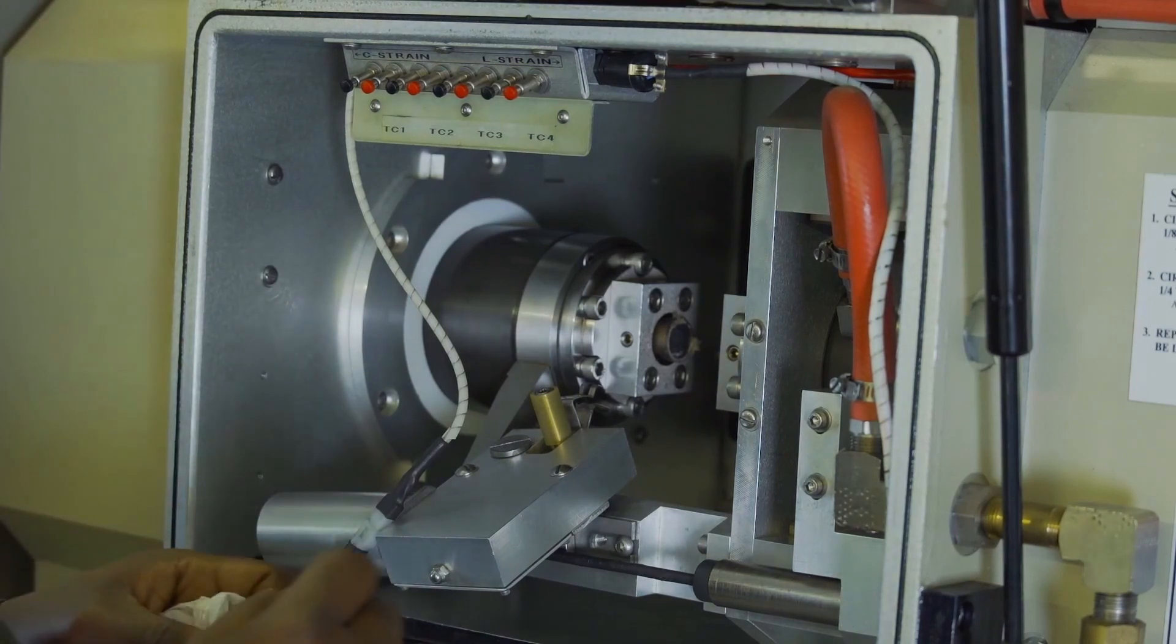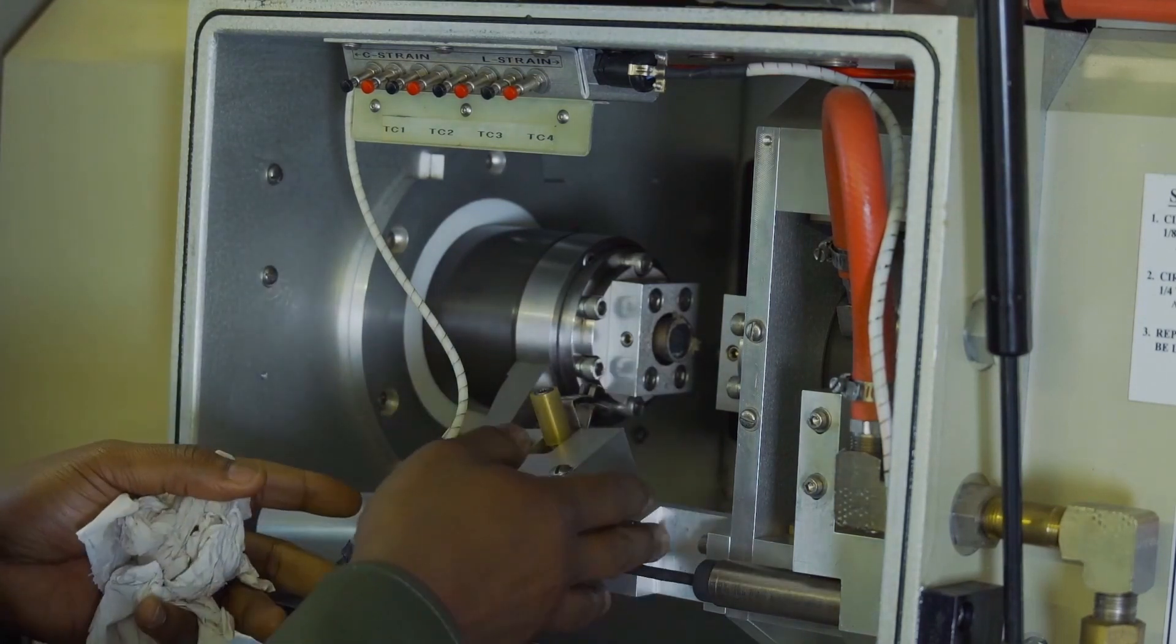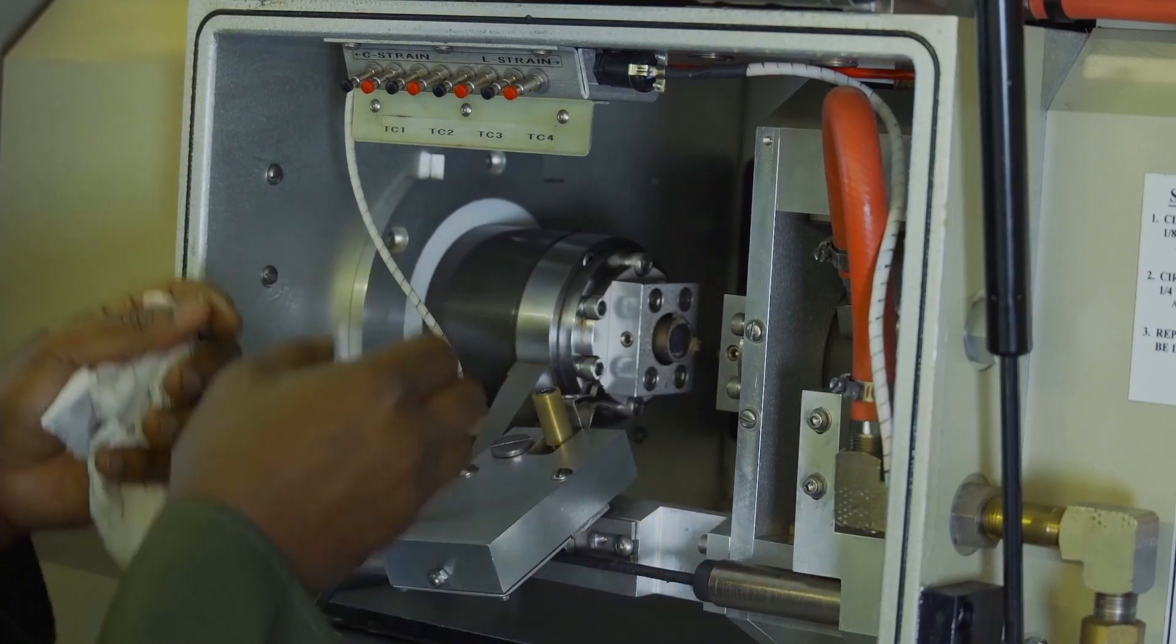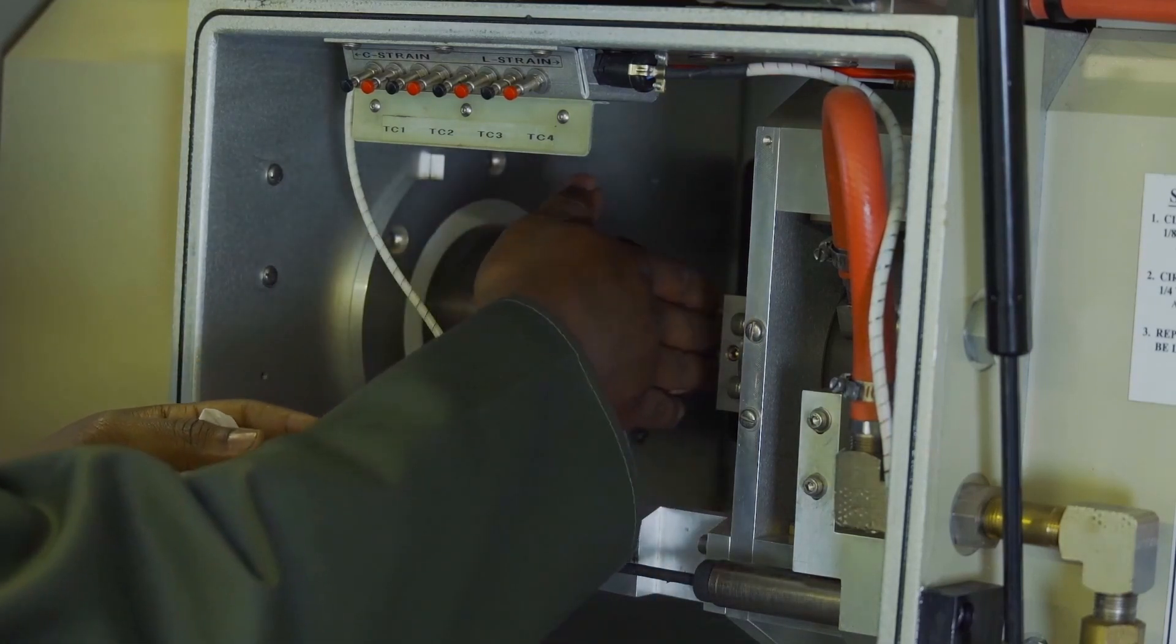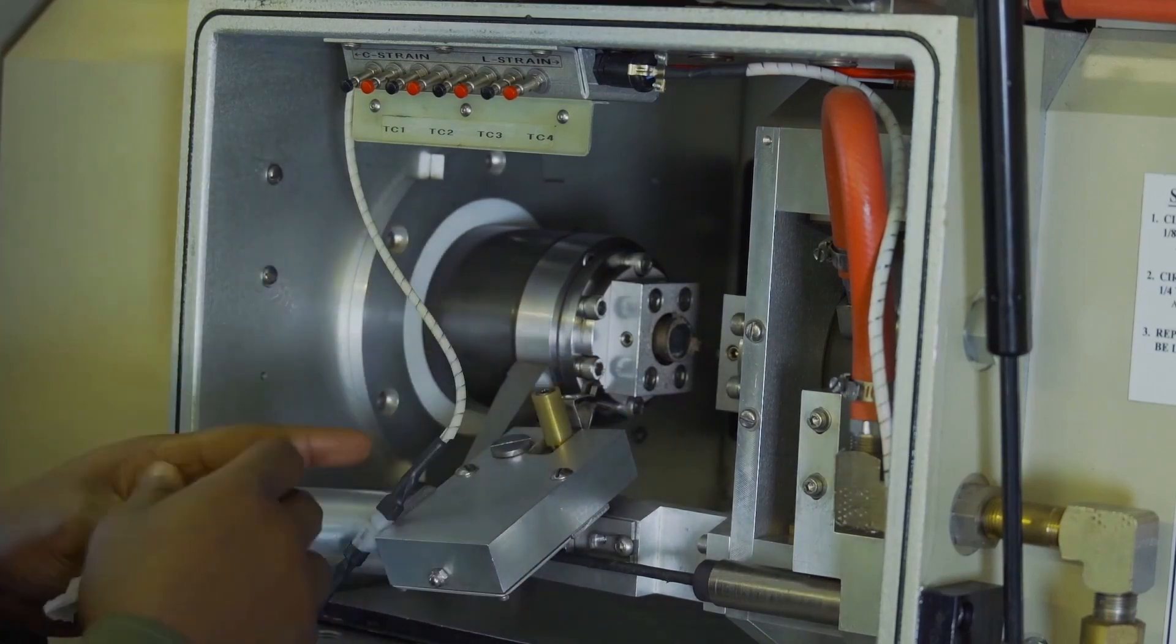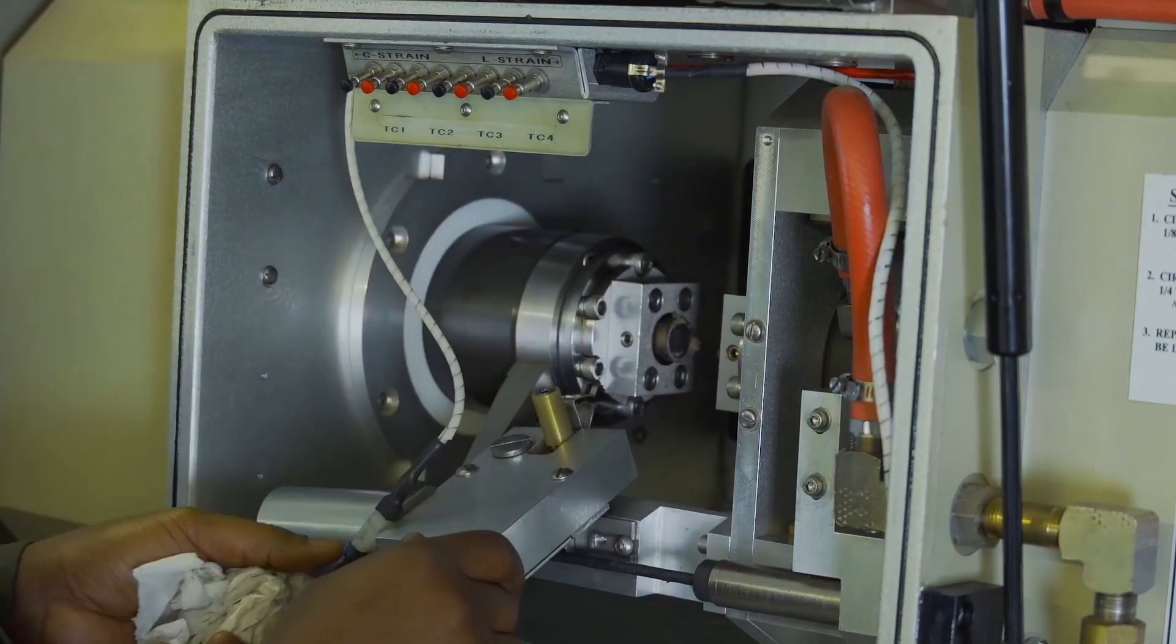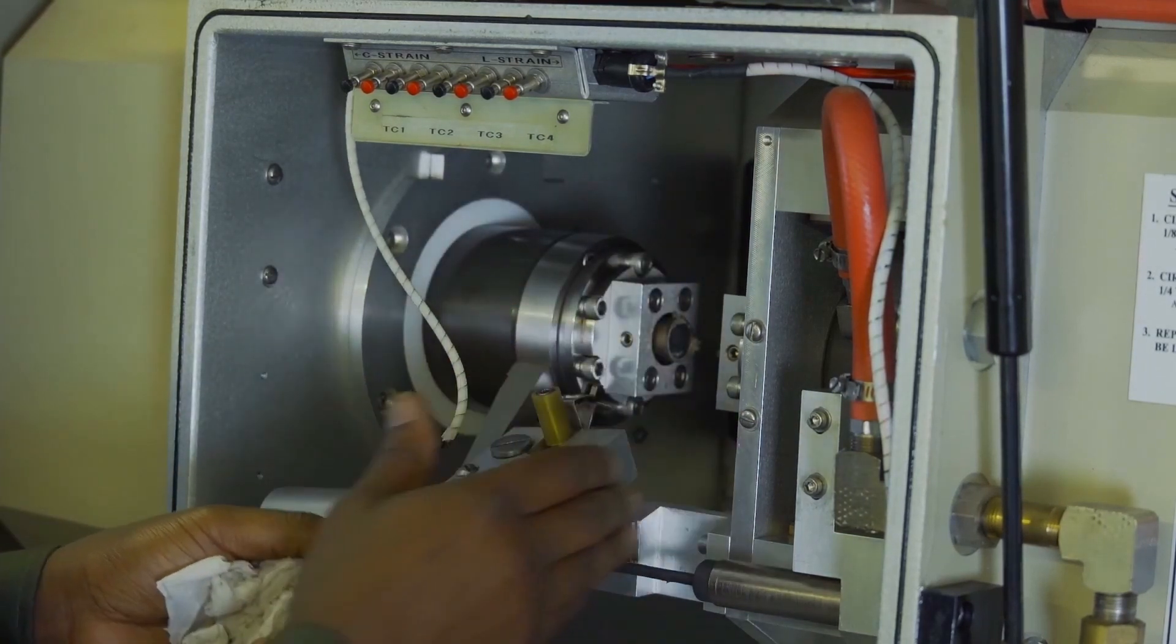We also have the specimen auto loader or sample auto loader. During the test you don't want to put your hand in here because you would mess up your hand, so we use an auto loader to load the sample.